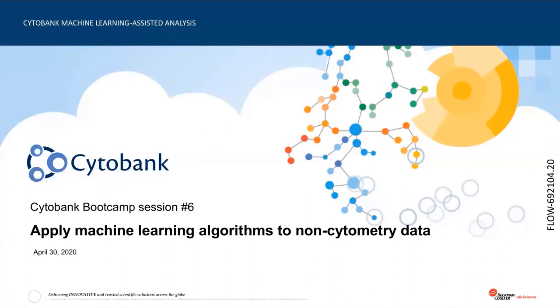It is my pleasure to talk about the Cytobank Job functionality in today's talk. Today is the last session of the Cytobank Bootcamp webinar series. In the previous five sessions, my colleagues talked about how you can use Cytobank to analyze cytometry data and how you can use different machine learning based algorithms to solve your research or biomarker discovery problems. In today's talk, we will go beyond cytometry data.